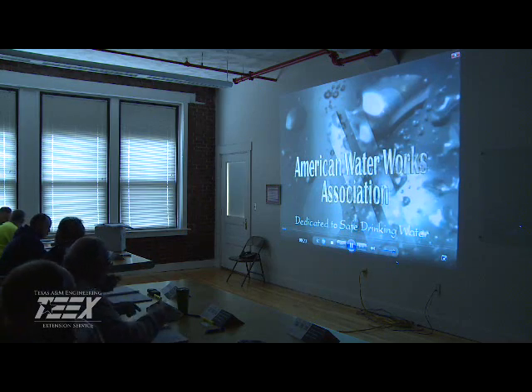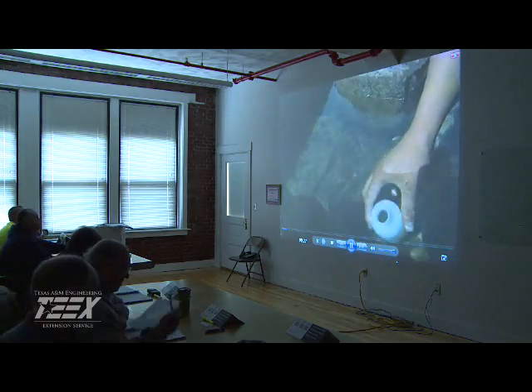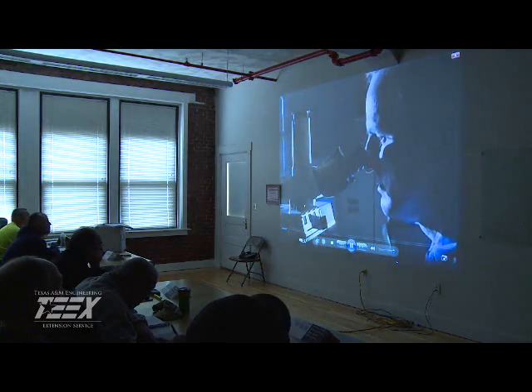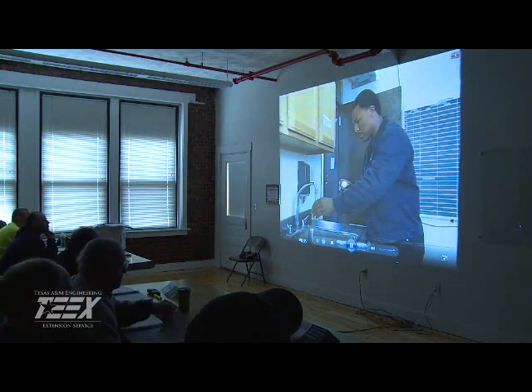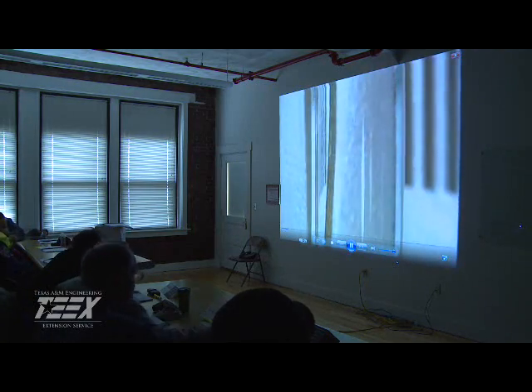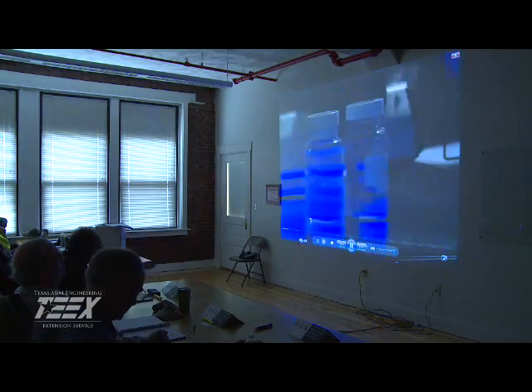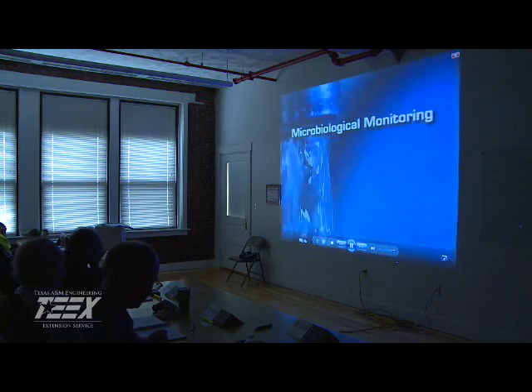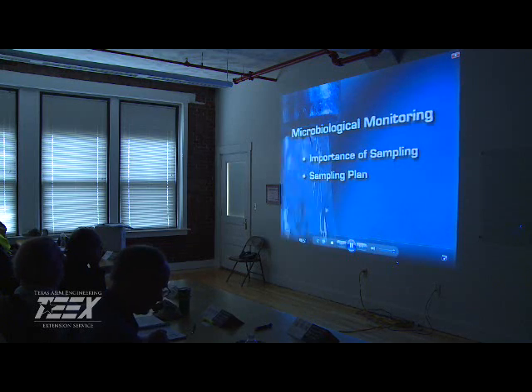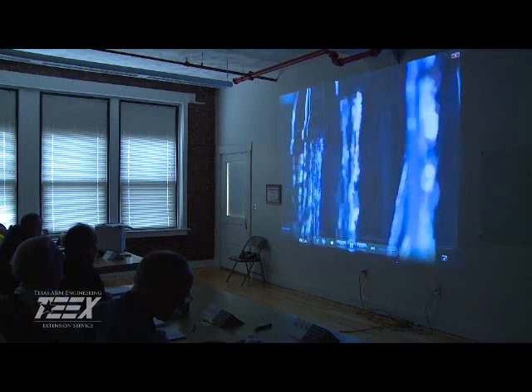Sampling, testing, and analyzing. Water professionals continuously monitor drinking water quality. Water suppliers regularly test for chemical, radiological, and biological contaminants. This video focuses on microbiological monitoring. It will explain why accurate sampling is crucial. It will describe what a sampling plan is, and it will demonstrate the procedures for collecting samples. Accurate sampling techniques and well-managed monitoring processes are essential to providing safe, clean drinking water.